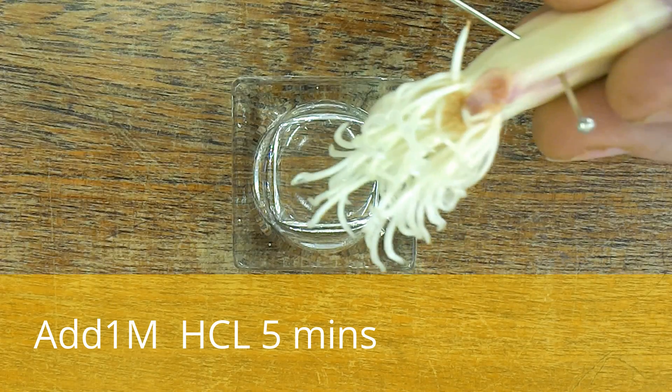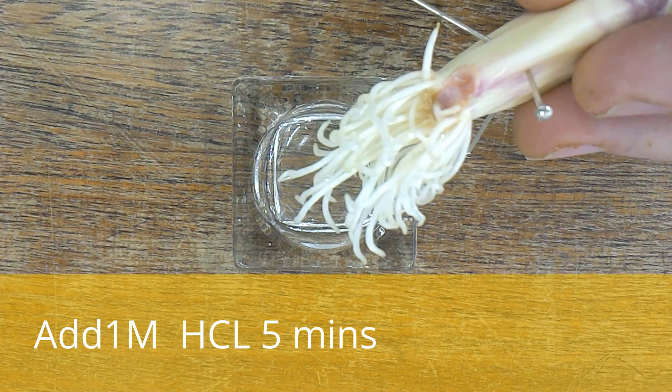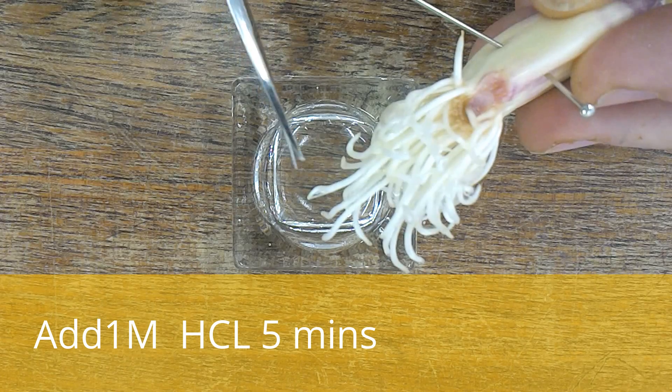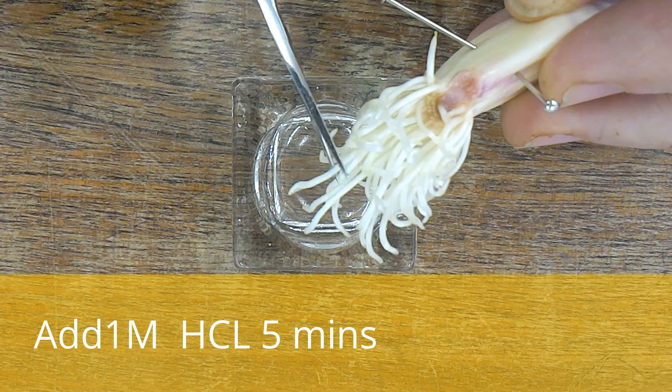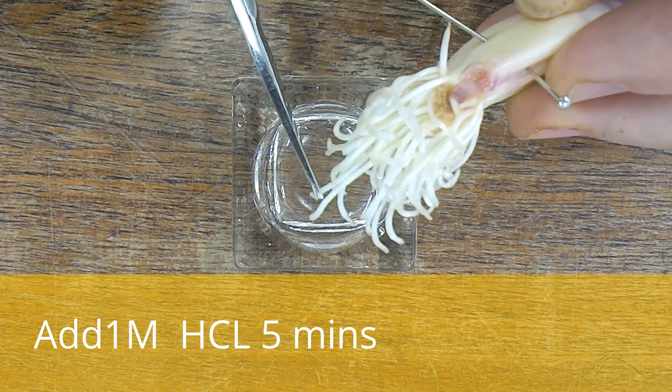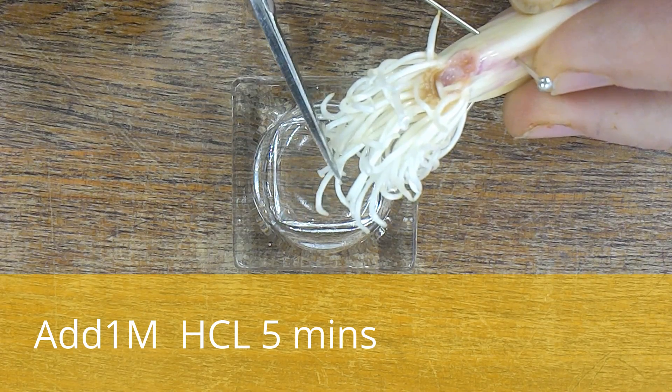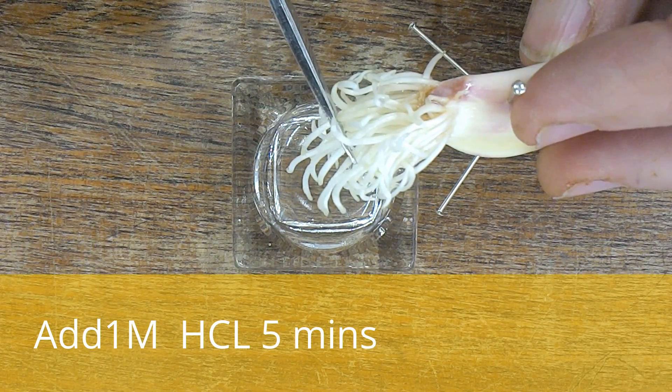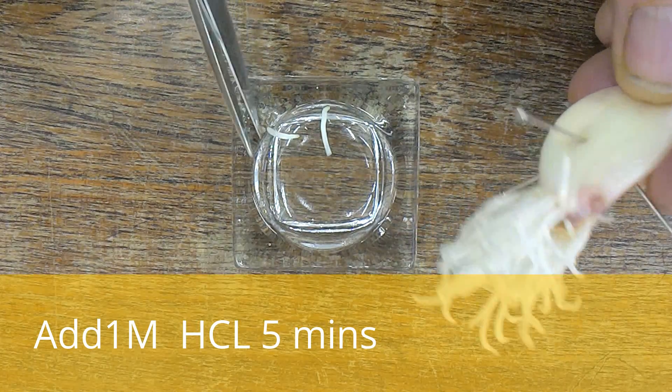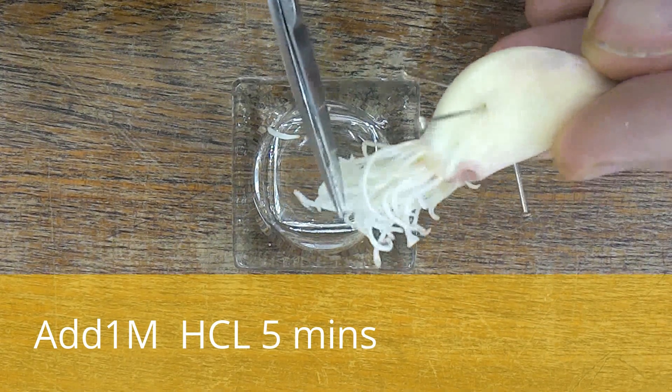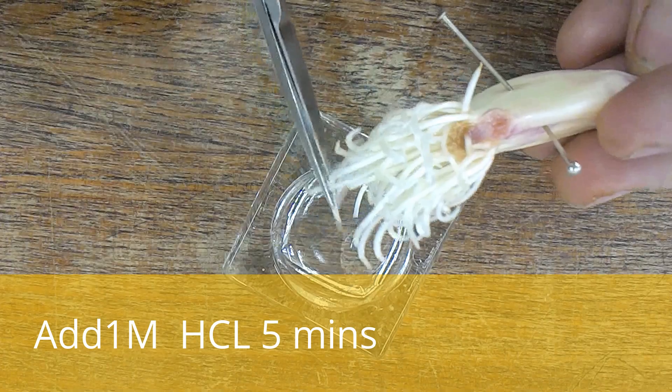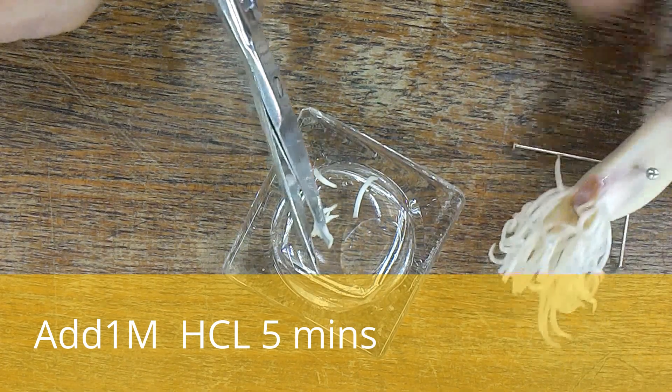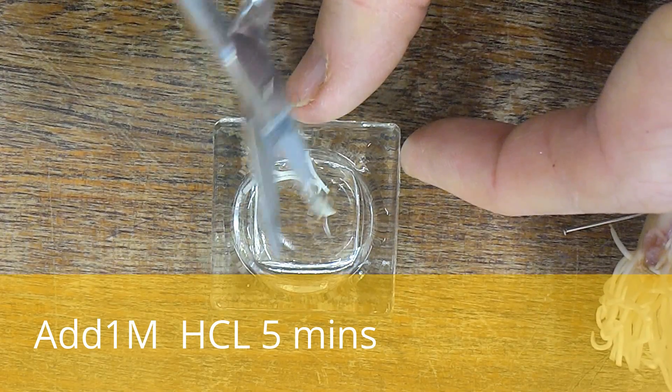To prepare garlic root tips for mitosis, we're going to cut off one centimeter from the growing end of five roots, putting them into a glass block. I'm dropping them in there. You get several tips; I've got more than five, quite a few there.